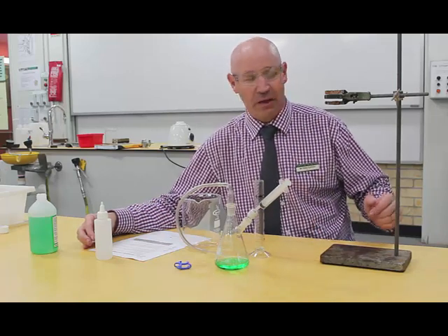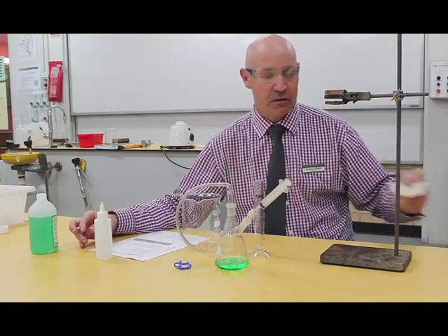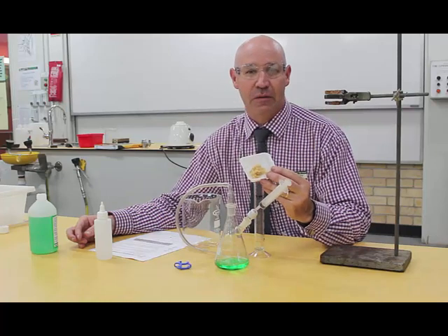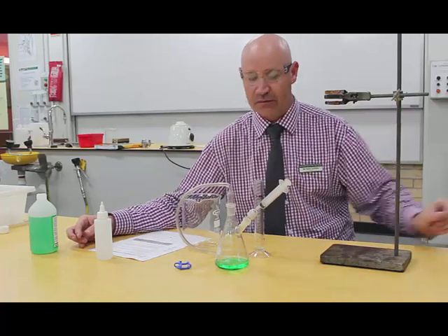The type of catalase we're going to use in this experiment is in potato cells. So I've just minced some potato in the blender. I've got 10 grams of that.